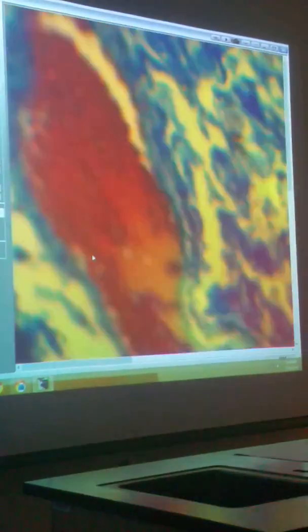What do you think this one is right here? Is that an ileum? No, stomach? It looks like the stomach, right? Can you focus it? It's really blurry. There we go. That's good.